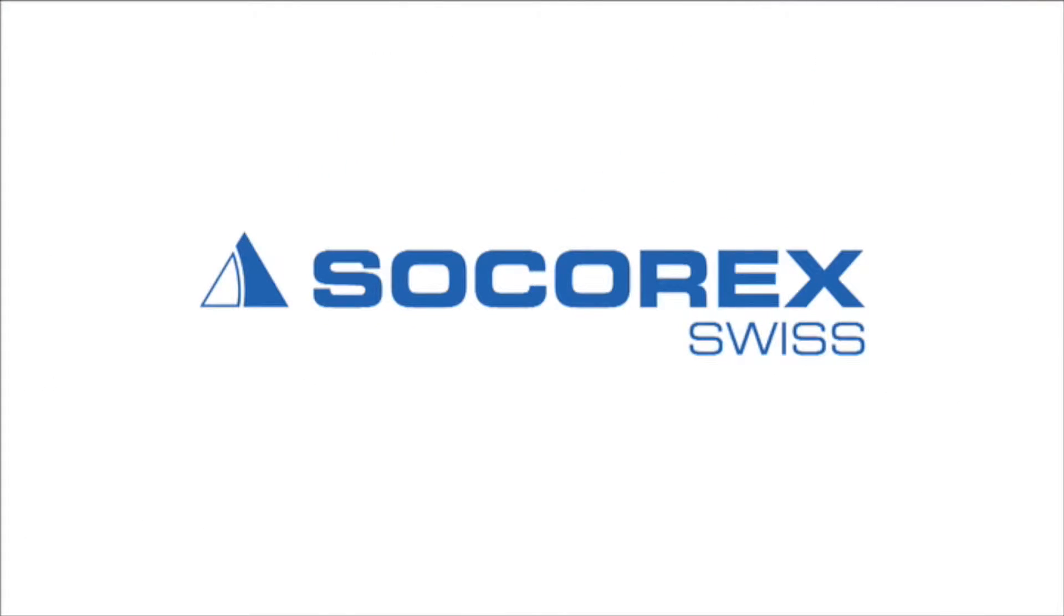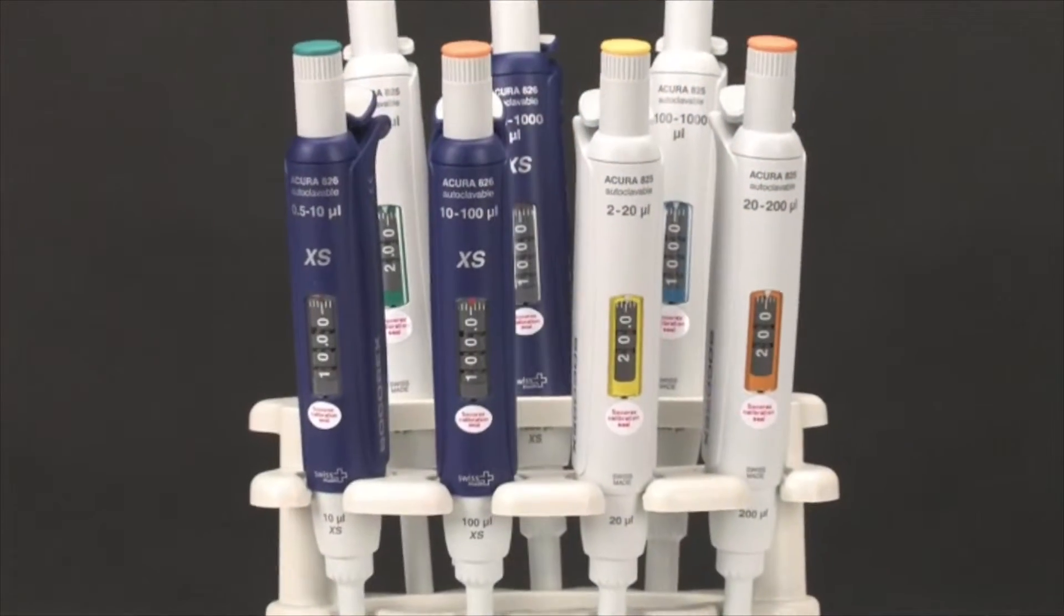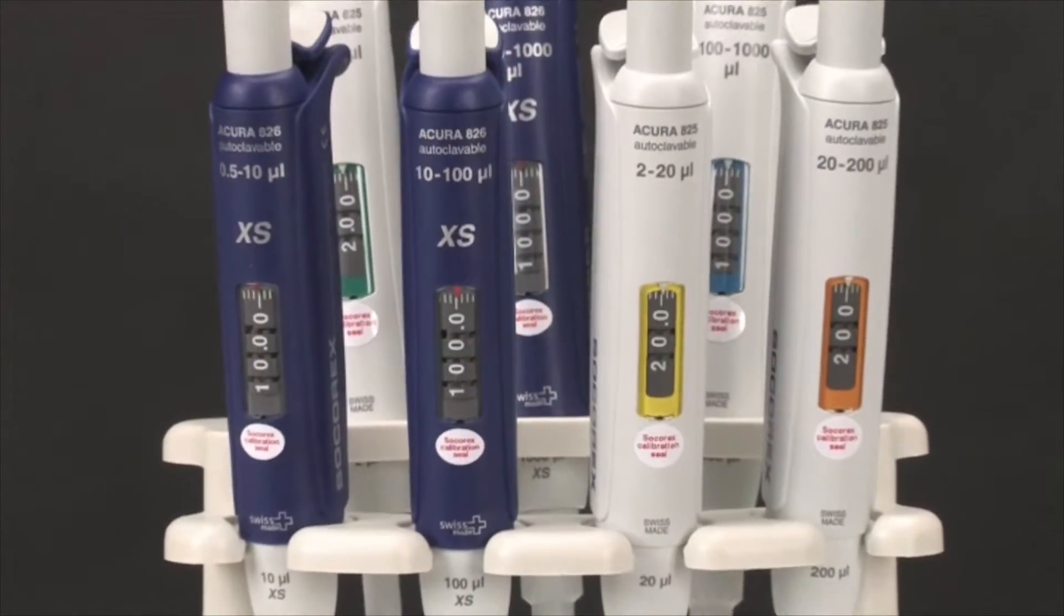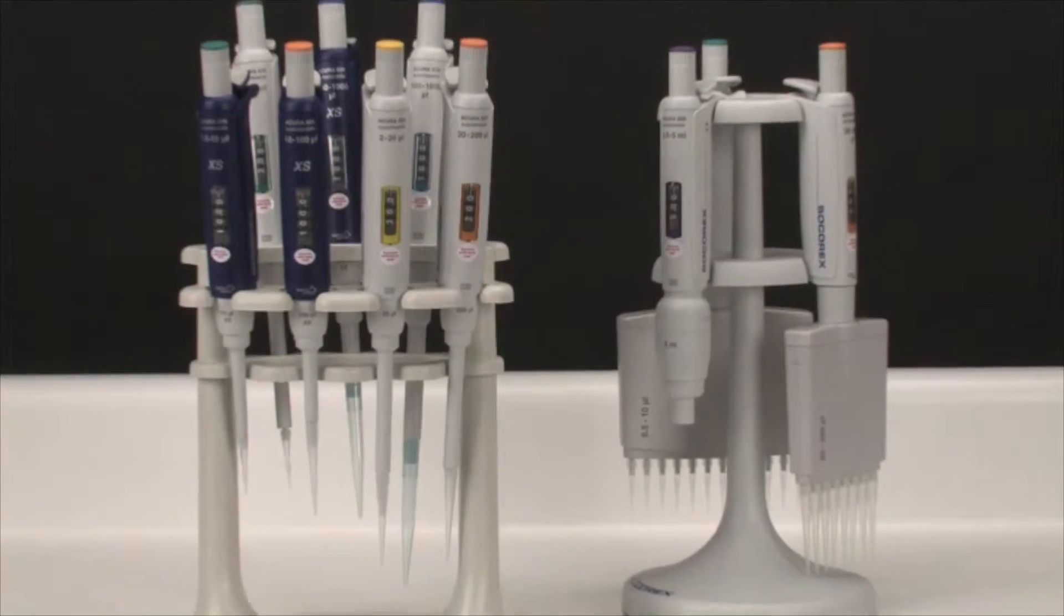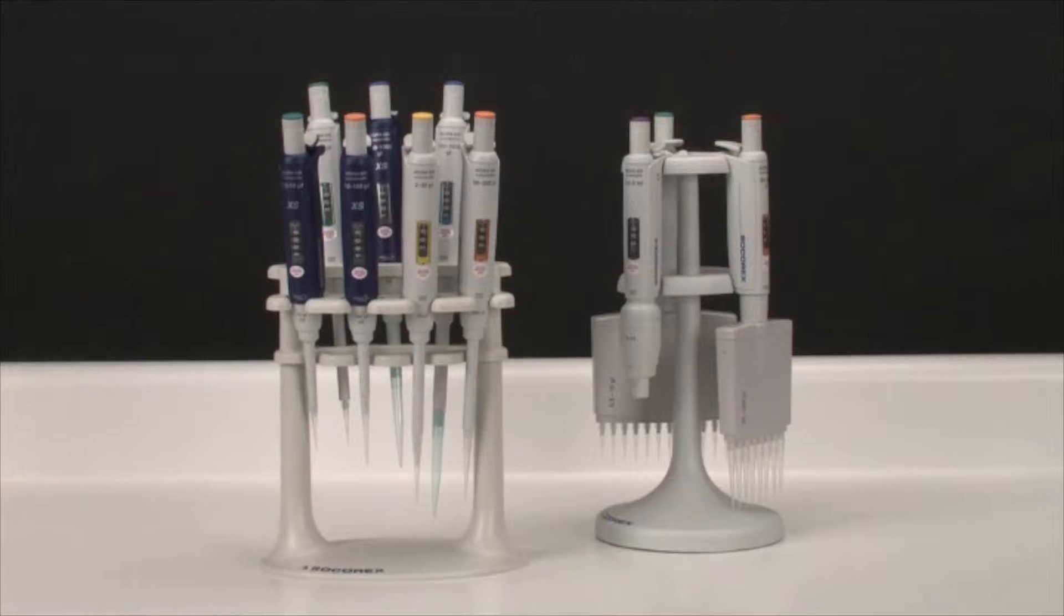Socorrex Acura manual pipettes. The Acura series of variable volume pipettes from Socorrex offer a wide selection of high precision solutions to meet the exacting demands of your specific liquid handling application.